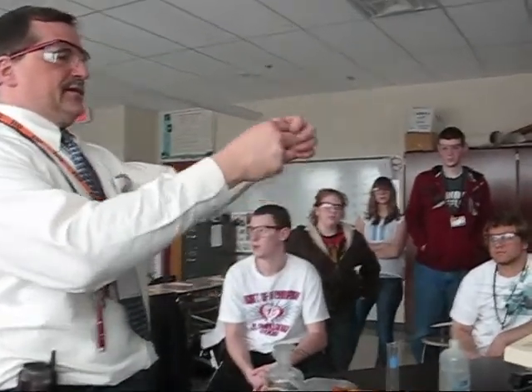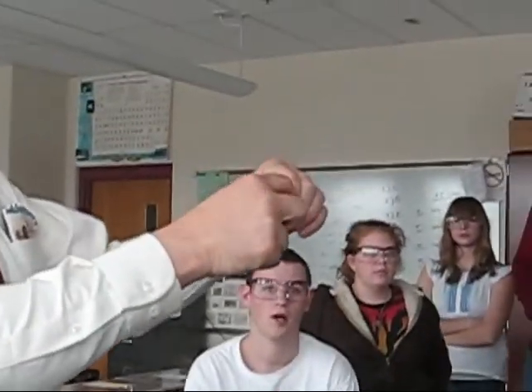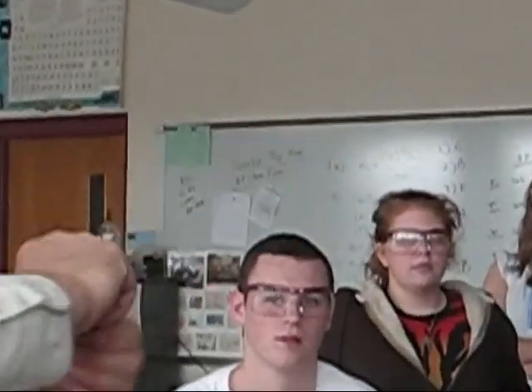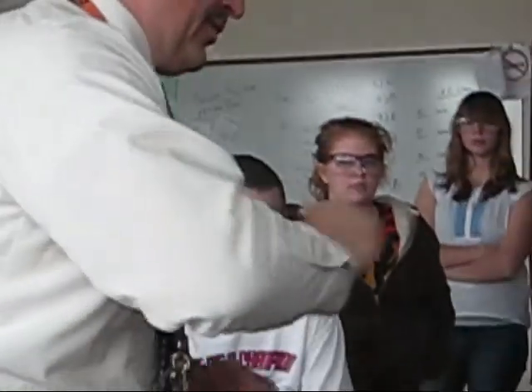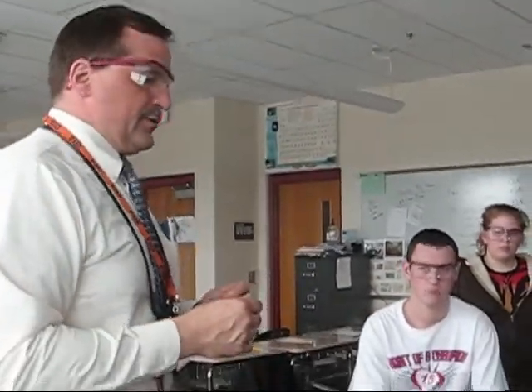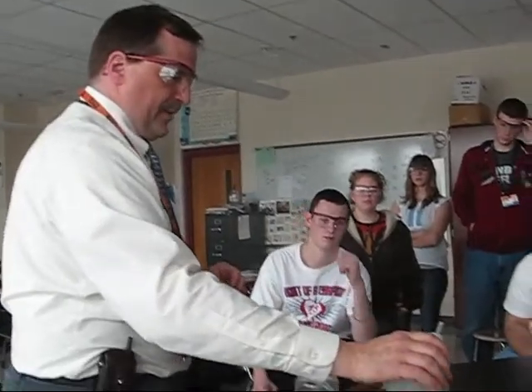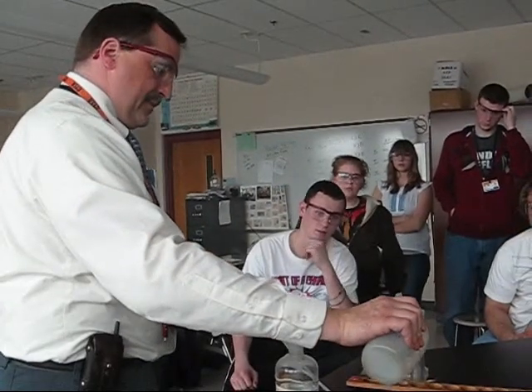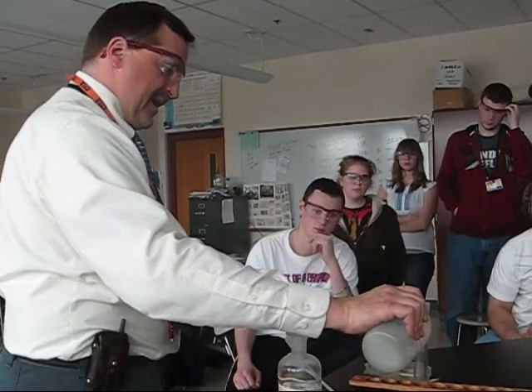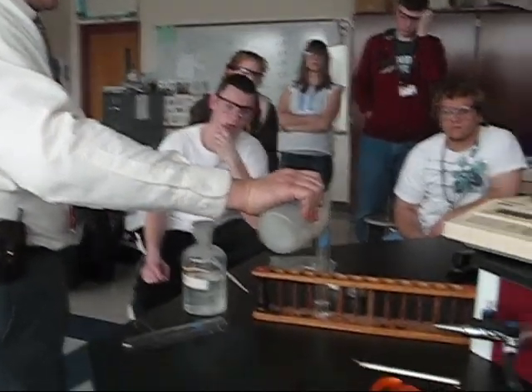Here are the strips of magnesium. This is a little piece — we'll just tear a chunk off of it. Notice I didn't handle the calcium. So that might give you a clue on the reactivity. Handling calcium is dangerous; magnesium, not so bad.